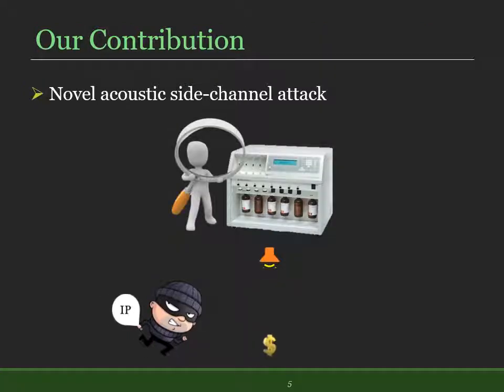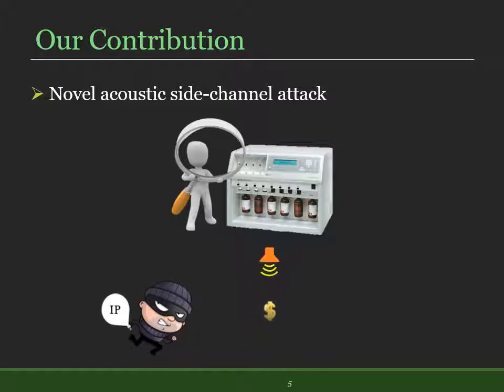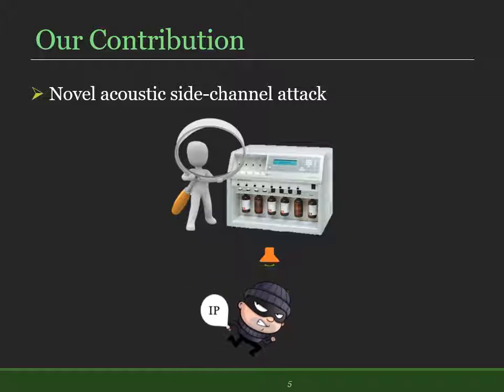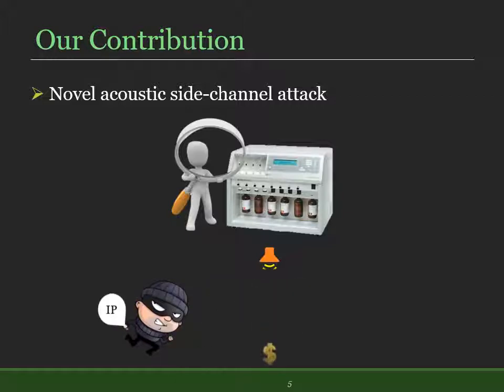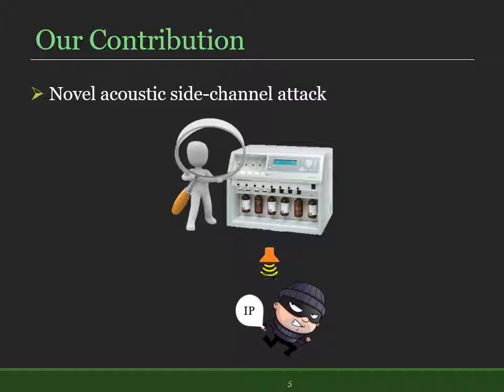In this video, I'm going to introduce a new way of stealing the order of the bases in the DNA synthesis process. We show that it's possible to take advantage of the acoustic side channel to predict the structure of the synthesized DNA molecules.